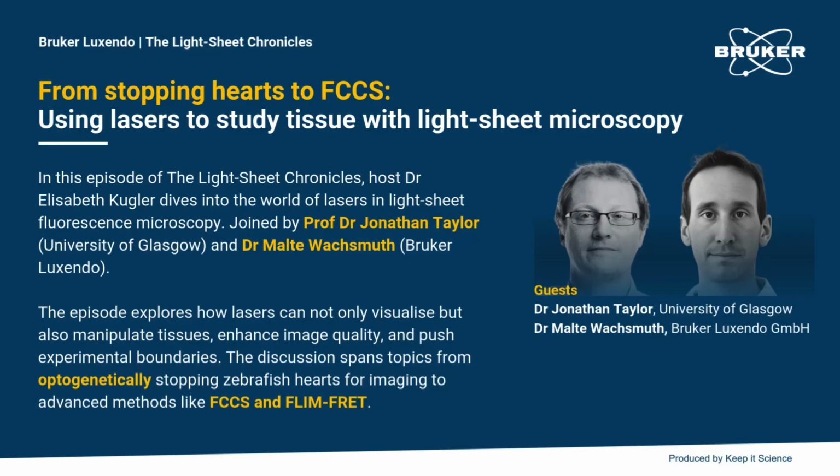The problem, though, is that this comes with a bit of a trade-off. Particularly with Airy and Bessel light sheets, you get these side lobes. So you don't just have a single thin light sheet, you get additional sheets alongside it. So you've got this trade-off, and I think it's quite interesting that it's well accepted that there's this fundamental limit of physics for a Gaussian beam, but I'm not aware of a really well-established theory that says there isn't, out there somewhere, some kind of strategy for forming a light sheet that would have better performance than a Gaussian.